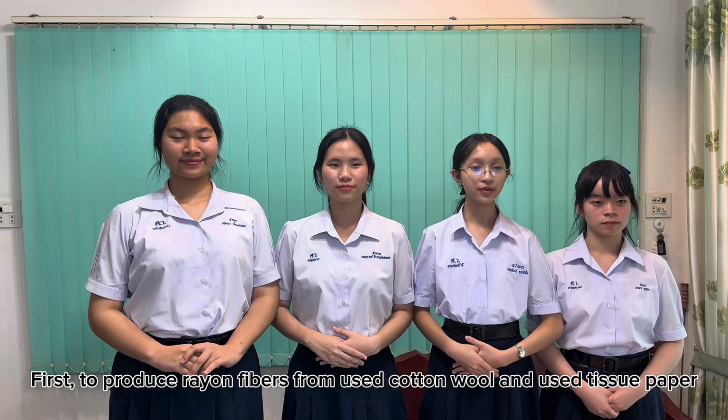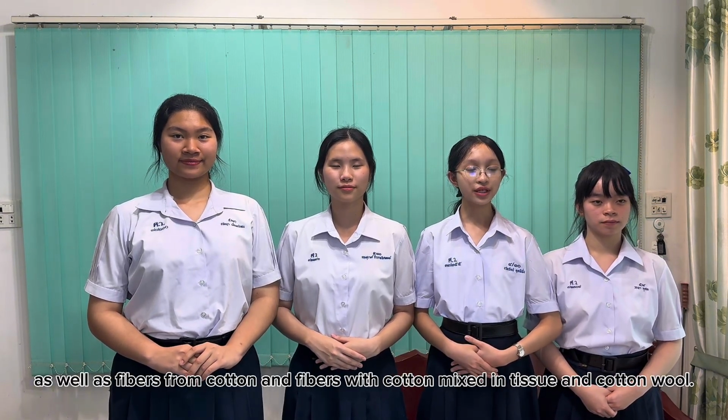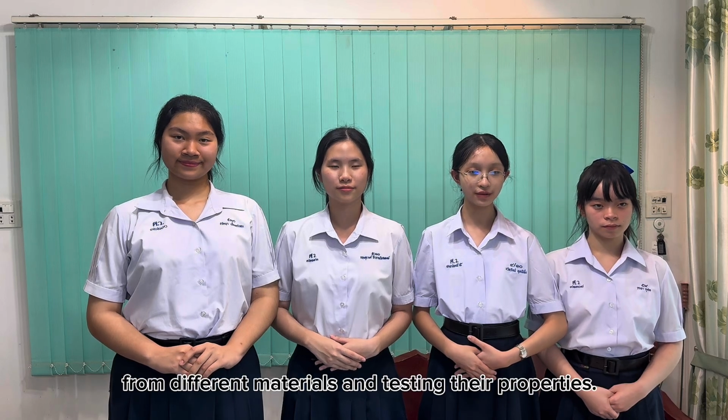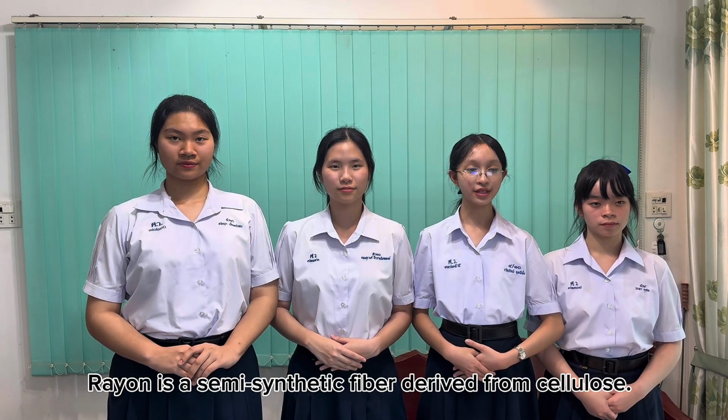These fibers could then be reused for other purposes. Objectives of the experiment are: first, to produce rayon fibers from used cotton wools and used tissue paper, as well as fibers from cotton and fibers mixing tissue and cotton wools. Second, to test the properties of these fibers prepared from different materials. Rayon is a semi-synthetic fiber derived from cellulose.